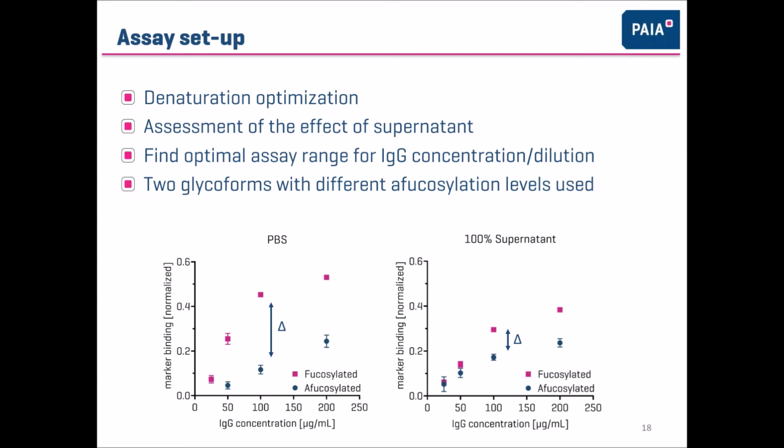But I'm not sure how much sense it would make to look at static, knowing that titer must not be very indicative of the scaling up from static cultures.